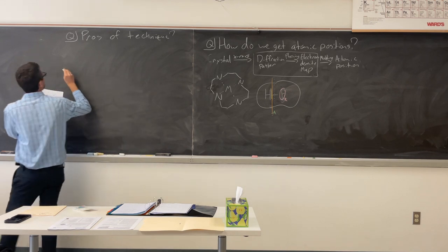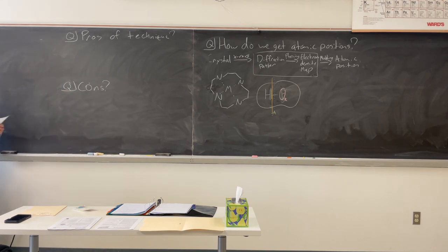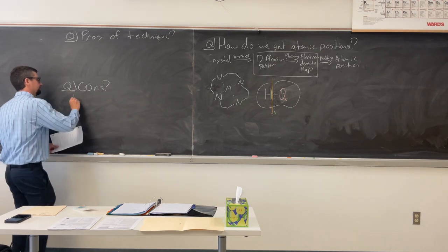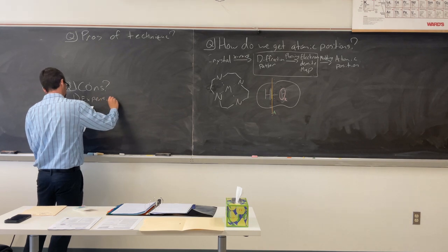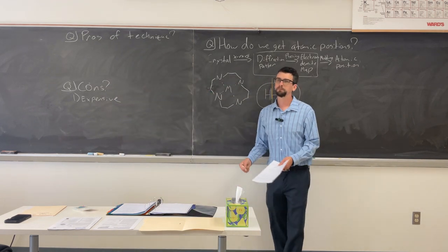And then we'll have cons. Give me a pro or give me a con. Yeah, Joe. Expensive. Give me another pro or a con. Hard to interpret.